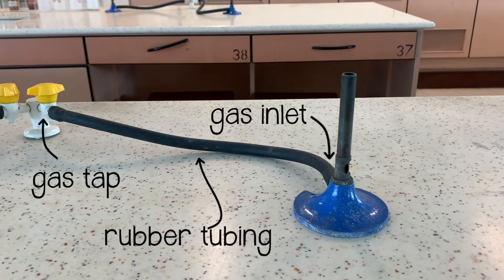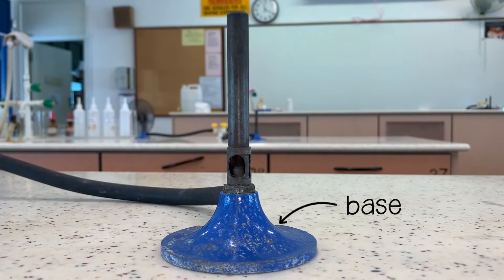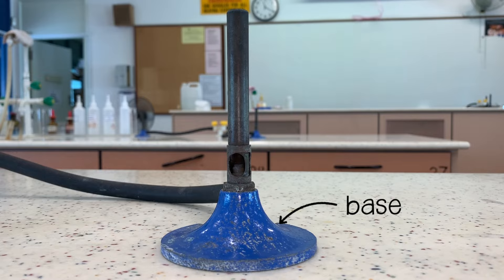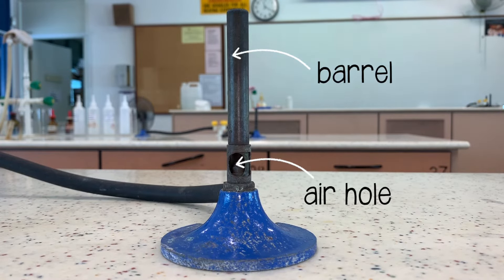The Bunsen burner is connected to the gas tab by a rubber tubing. The base provides support for the Bunsen burner. The air hole allows air to enter the barrel. The barrel raises the flame to a suitable height.